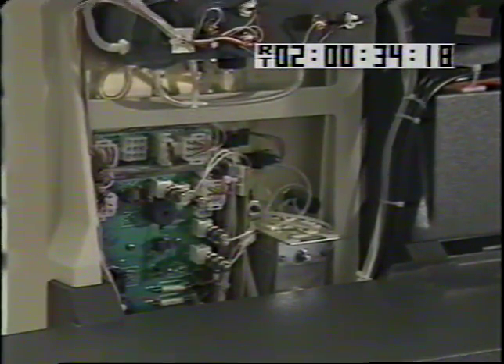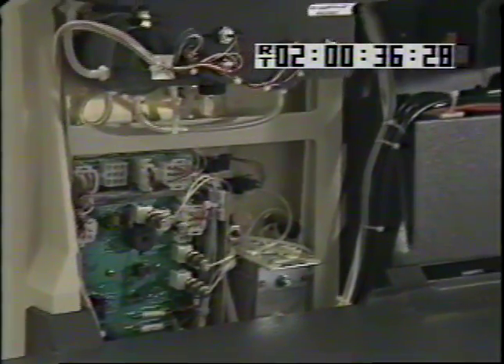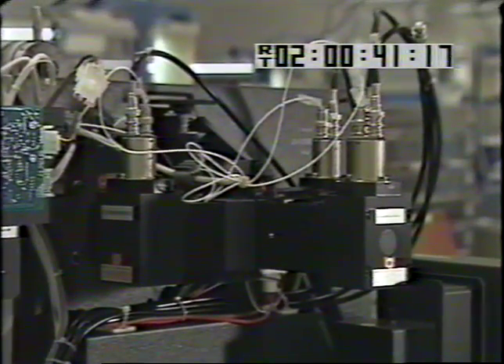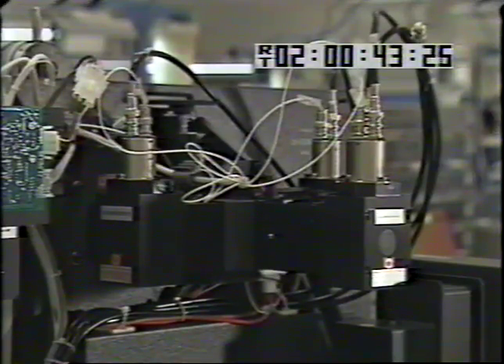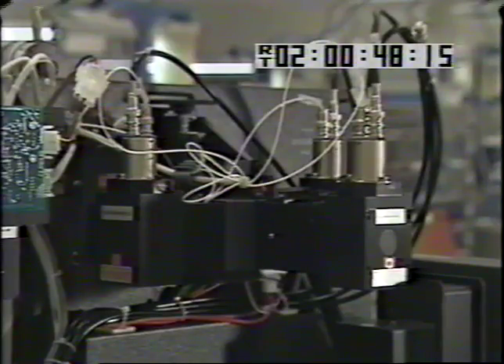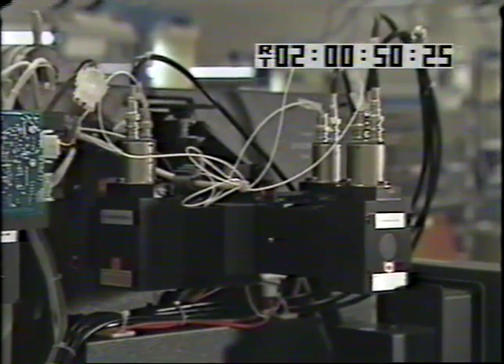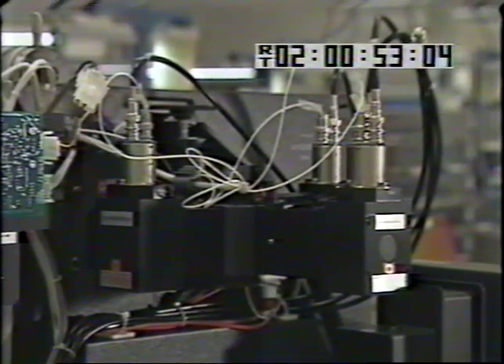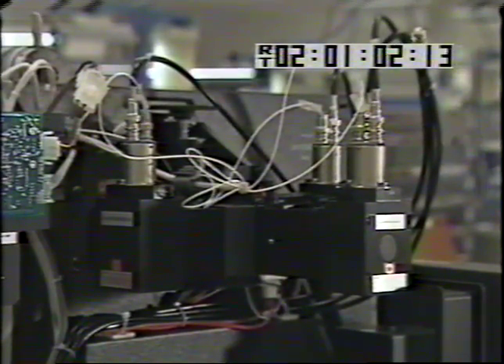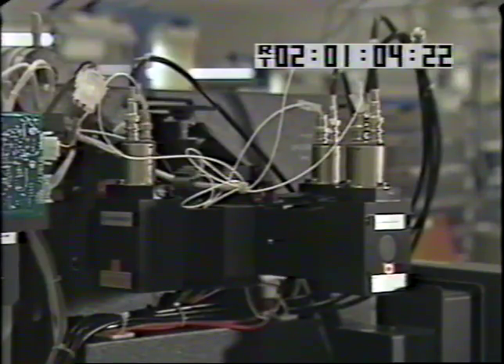On the right and to the top of the assembly, we can see the fluorescence channel block, which contains the 4 photomultipliers that are used to collect the fluorescent signals from the samples when they've been excited by the laser as the droplets pass through the laser beam. This is now the completed system and is the end of our manufacturing assembly process.